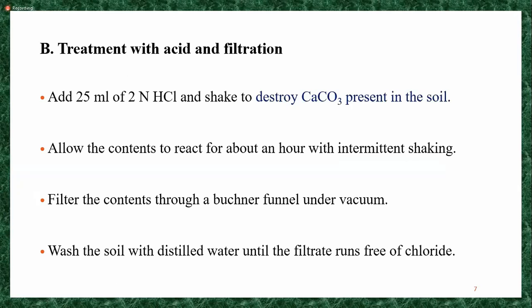For that we have to add some amount of distilled water, and using the vacuum we can remove the chlorides that are present in the soil. So this treatment is used to remove the calcium carbonate and the chloride. Are you all clear about this step?